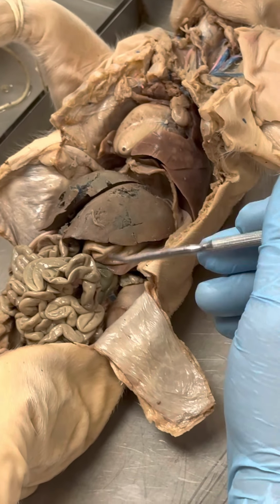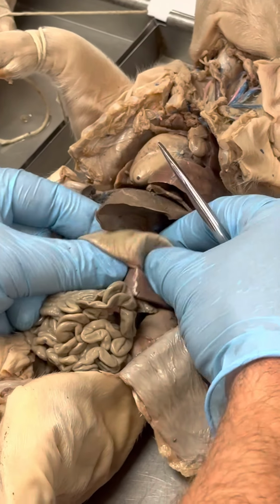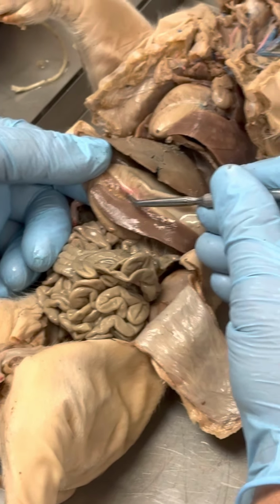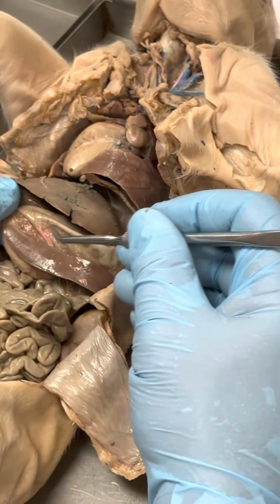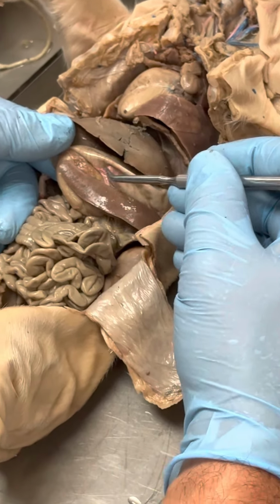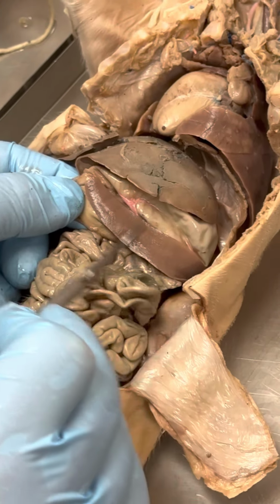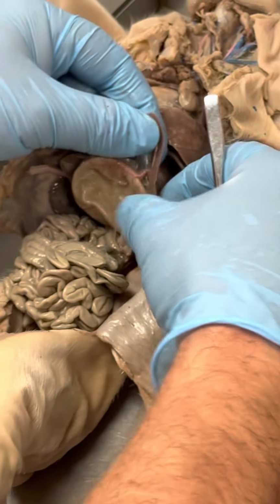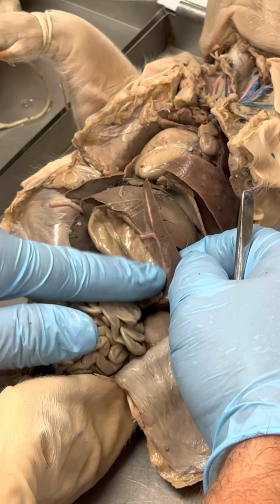Ooh, gastric. So where's the stomach? Gastric. So this is all stomach right here. That vessel going to it, that's going to be your gastric artery. For our purposes with these vessels, if you just say gastric vessel, that's good with me, because sometimes it's hard to differentiate between artery and vein. Splenic, that refers to spleen. This thing that looks like a big leech, that is your spleen. So I'm going to move that, and underneath that, there's your splenic vessel.